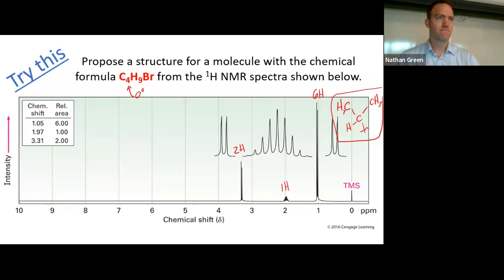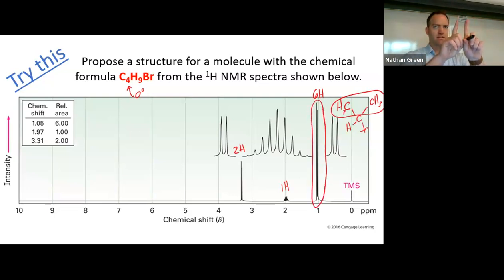It is 7 hydrogens because I'm accounting for the 6 hydrogens up here. And then this CH comes from the splitting pattern. No, not the 1H. We're not there yet. My signal told me 6 protons. Those are the 6 protons. I am saying that the 6 protons are next to a CH because they display as a doublet. And again, can we tell this is a doublet without the blow up? 2 peaks, twin towers, right?